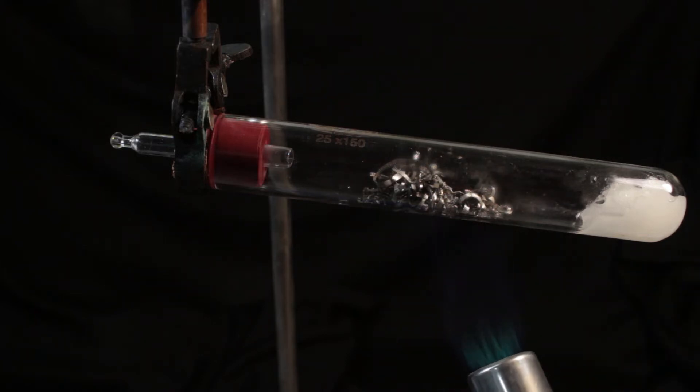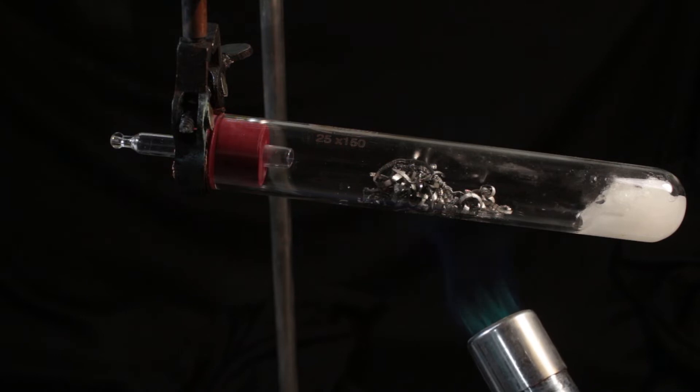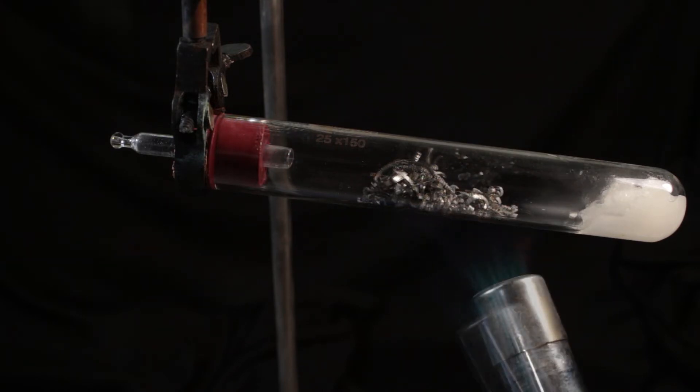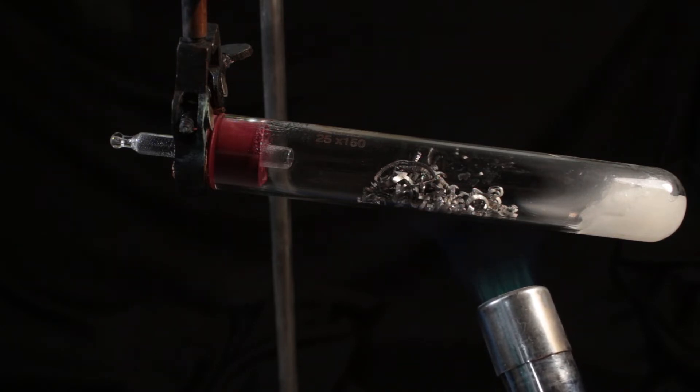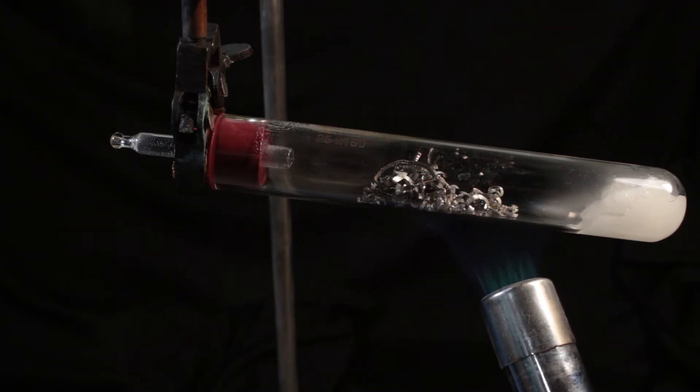Here I have cotton wool soaked with water and magnesium turnings in the middle of the test tube. I have to heat them up for quite a while. If I am careful with my heating of the cotton wool, it's not going to decompose. As soon as it remains wet, temperature never rises higher than 100 degrees.